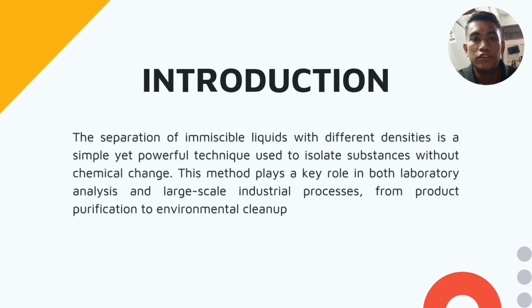The separation of immiscible liquids with different densities is a simple yet powerful technique used to isolate substances without chemical change. This method plays a key role in both laboratory analysis and large-scale industrial processes, from product purification to environmental cleanup.